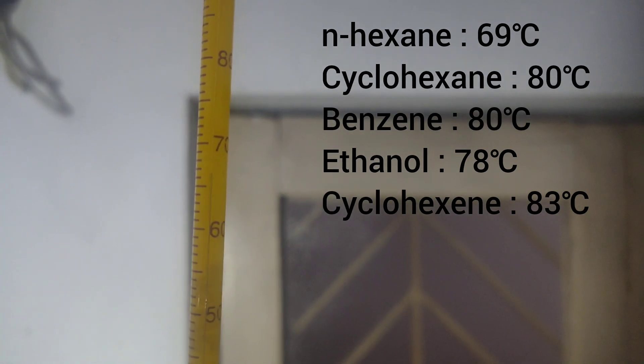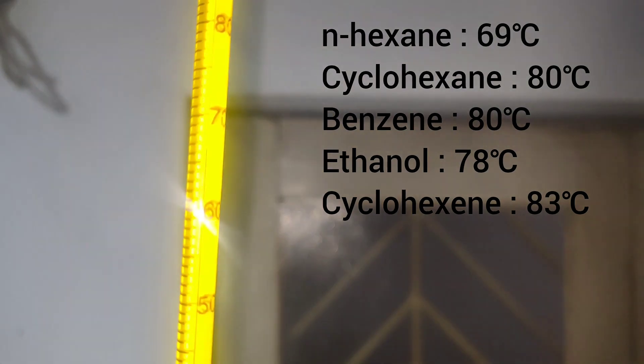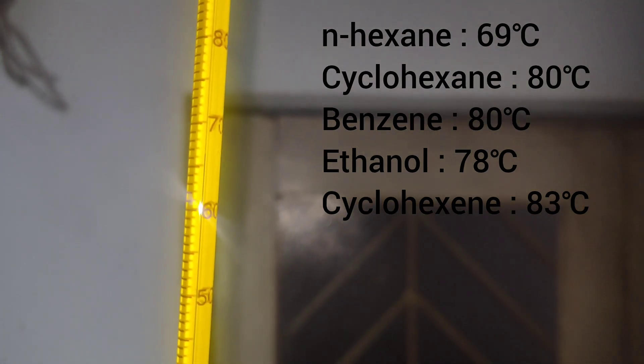And increased the temperature of heating mantle. Now, I collected everything that came around 65 to 80 degree celsius. This fraction contains nhexane, cyclohexane and benzene.